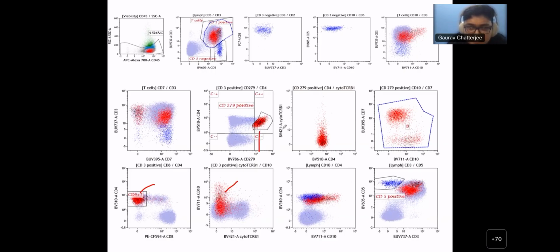And what about this? Like, Vats, can you just take this plot? What do you see in this plot? What is this marker? Some TRBC1. What do you know about this? Have you heard of this marker, Vats? Yeah, so at this point, let's take a detour and discuss the concept of TRBC1.